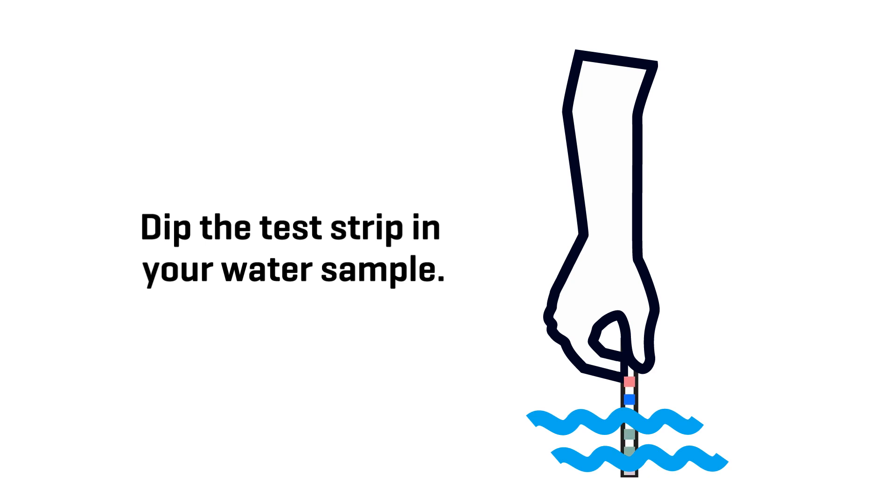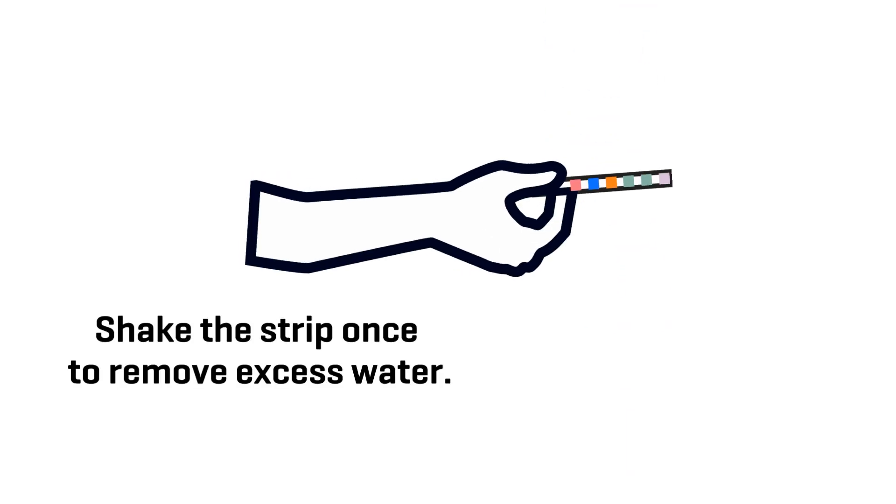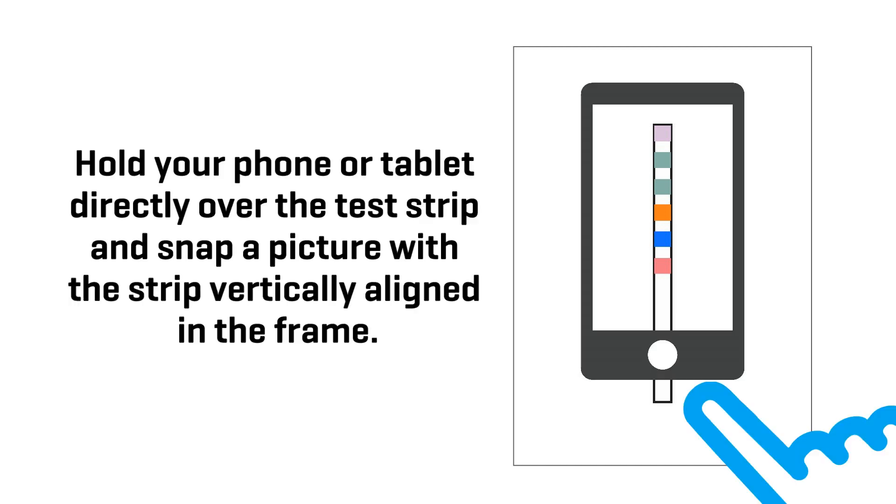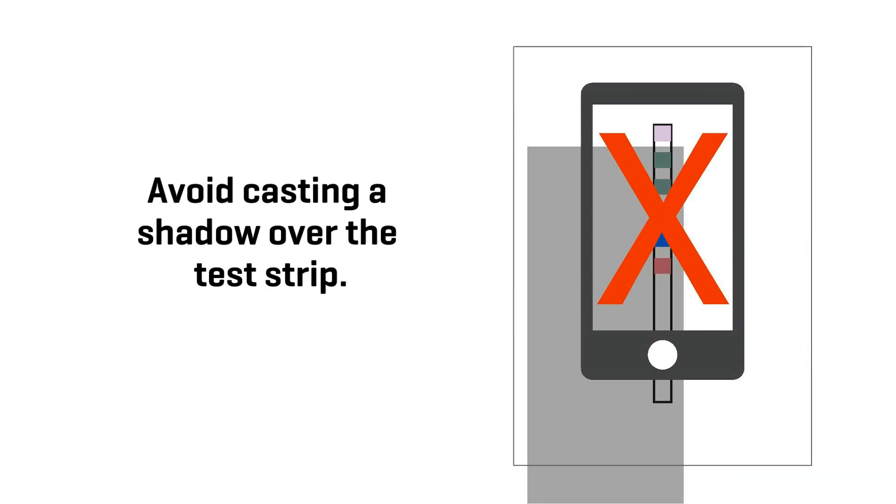Dip the test strip in your water sample. Shake the strip once to remove excess water. Place the strip on a plain white surface, like a piece of unlined paper. Hold your phone or tablet directly over the test strip and snap a picture, with the test strip vertically aligned in the frame. Avoid casting a shadow over the test strip. Be sure to photoscan the strip before 60 seconds have passed since dipping the strip.